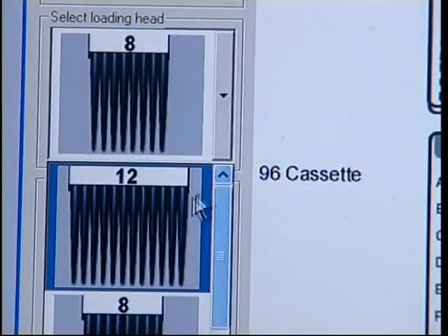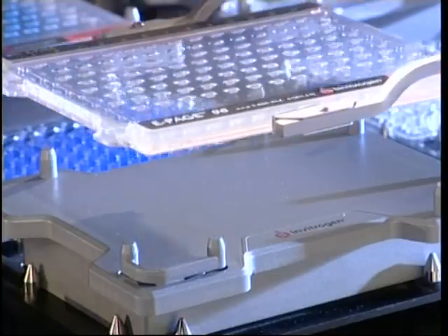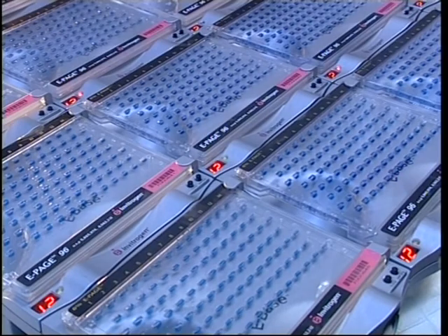Select your specific loading pattern through the eEditor. Once loaded, it is possible to remove the cassettes from the base or insert new ones. The wireless control device enables the creation of a hands-free zone for gel running, making it possible to manage and control multiple ePage and eGel runs directly from your desktop.